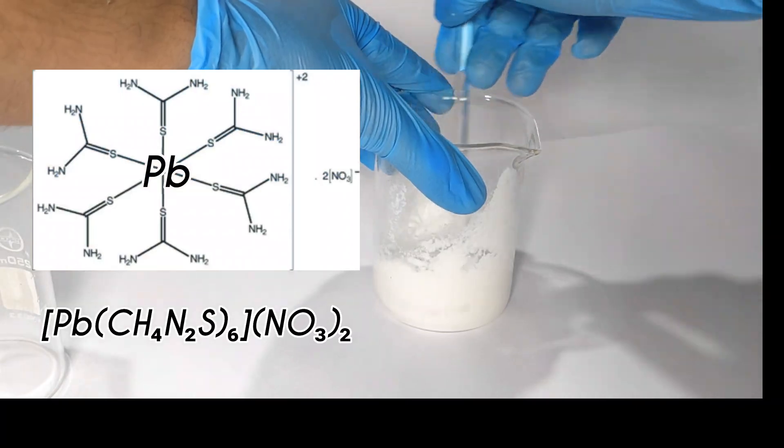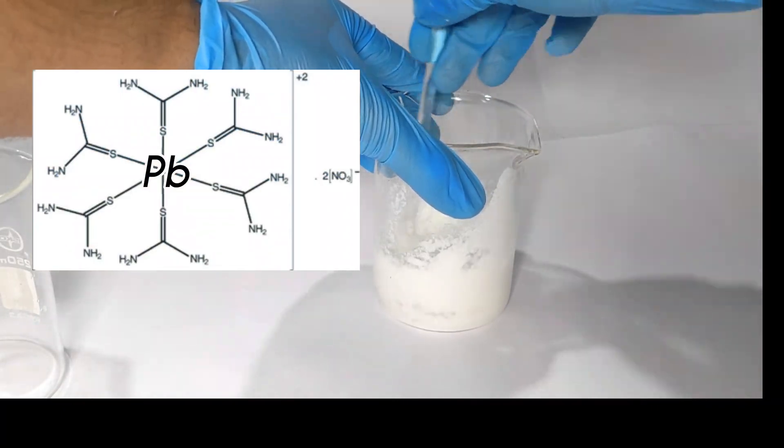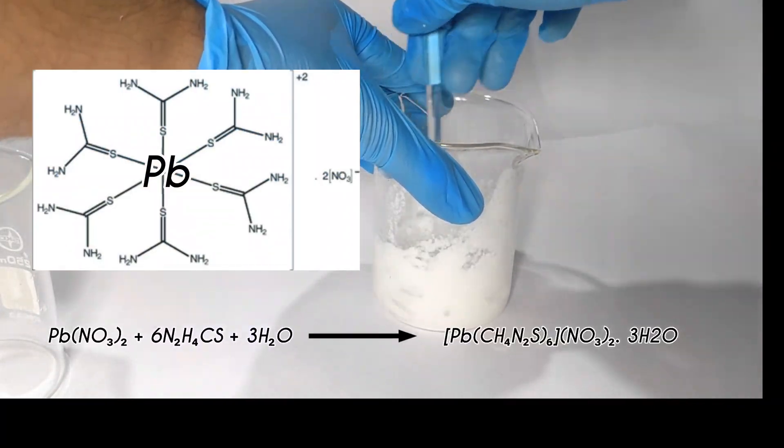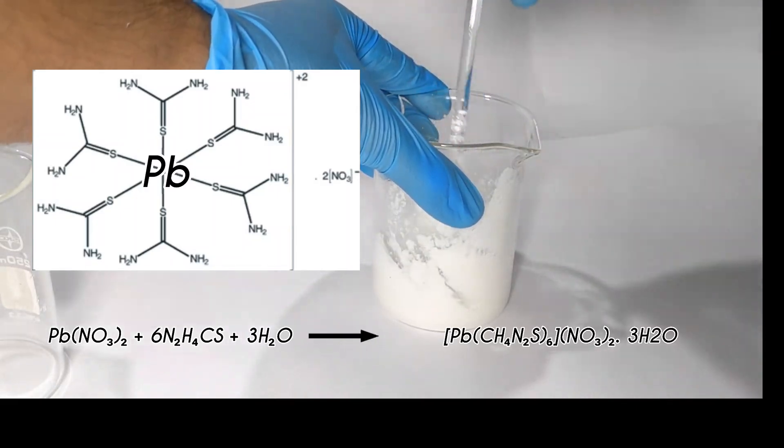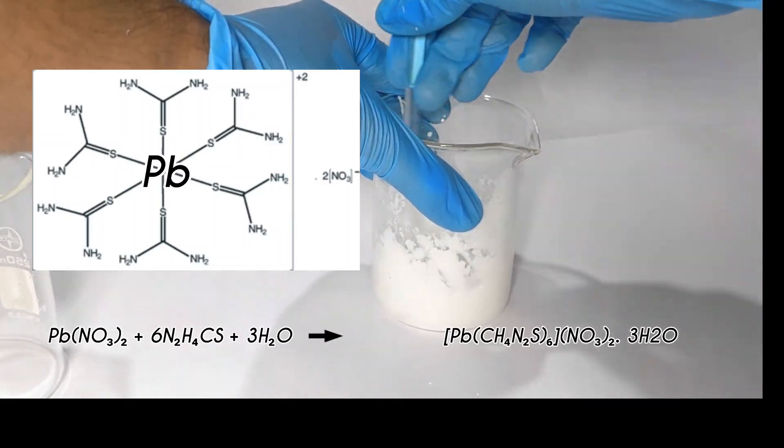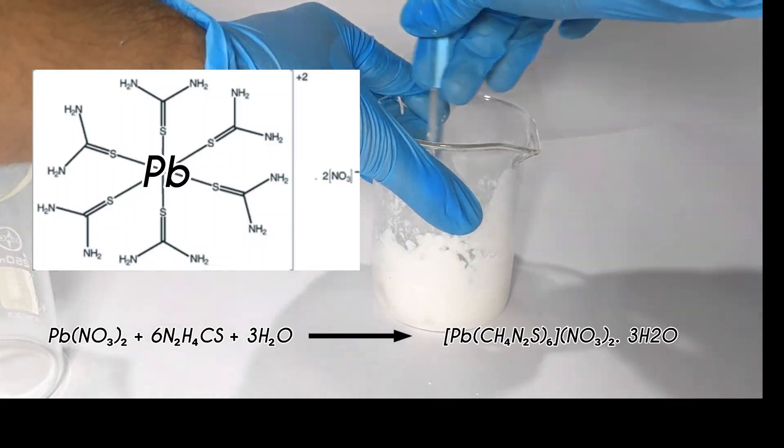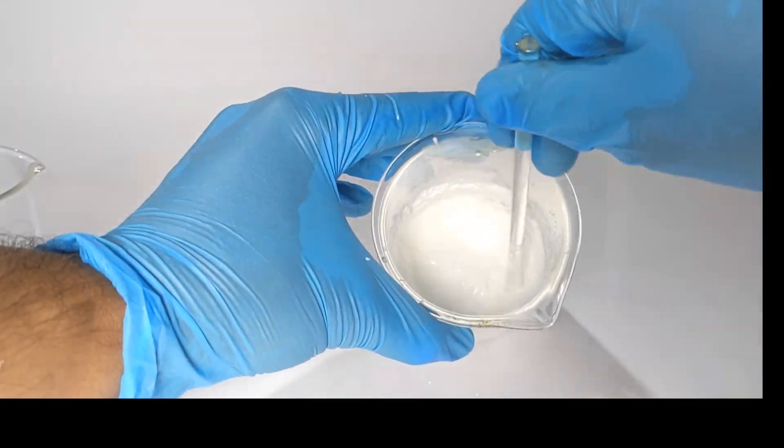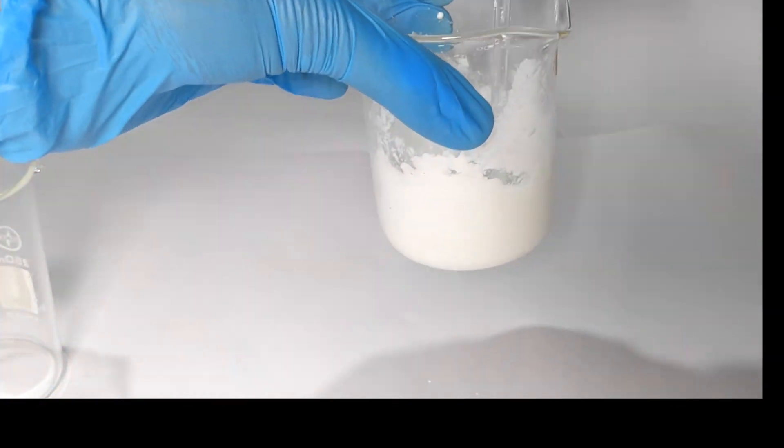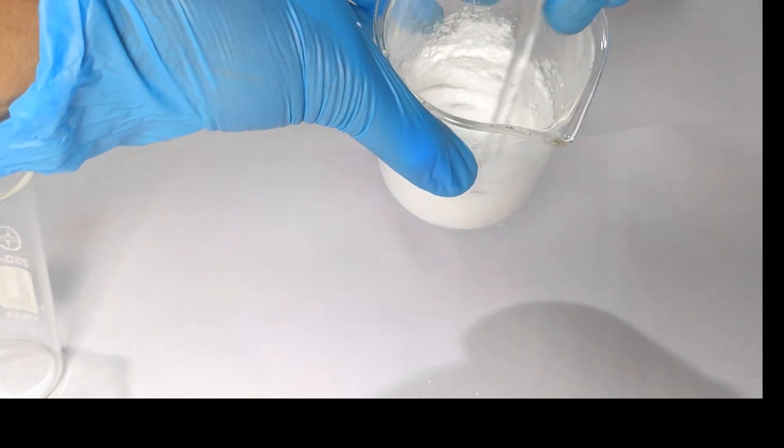This is the crude crystalline precipitate of hexakis(thiourea) lead(II) nitrate. This coordination compound has lead-ion in the center linked octahedrally with the sulfur moieties of six thiourea molecules. The crude crystalline precipitate somehow reminds me of vanilla ice cream.